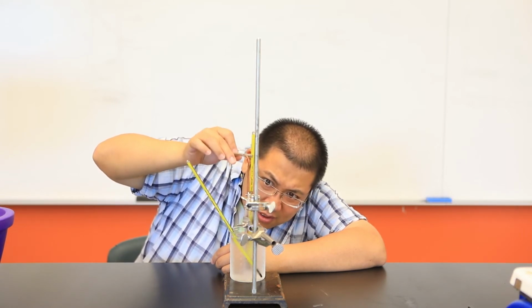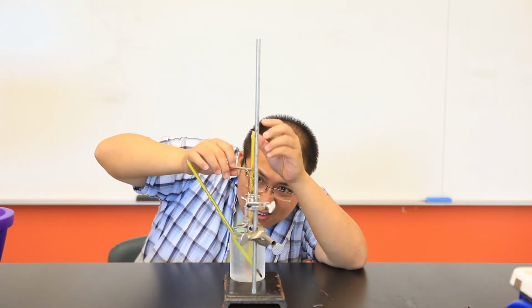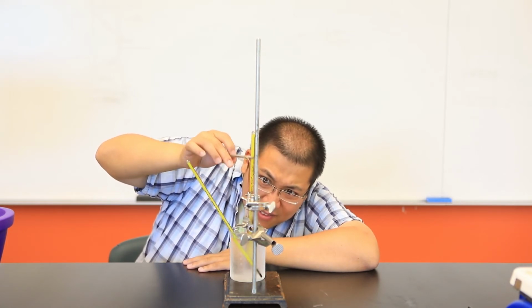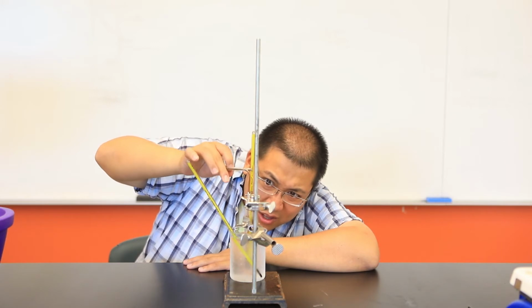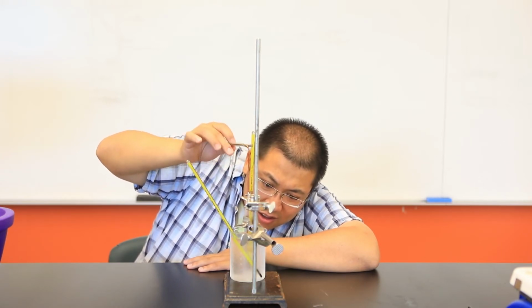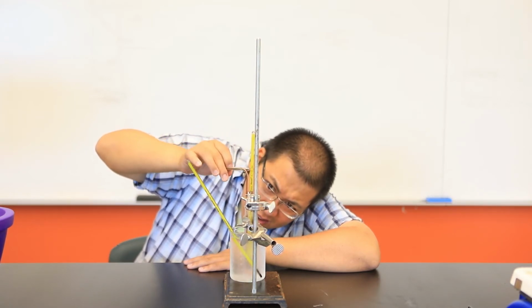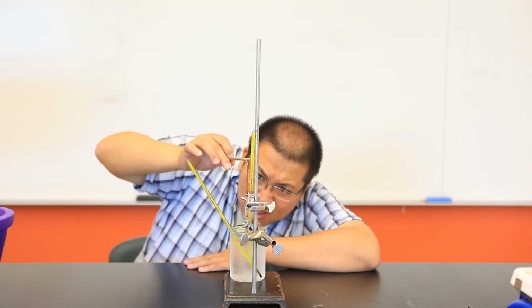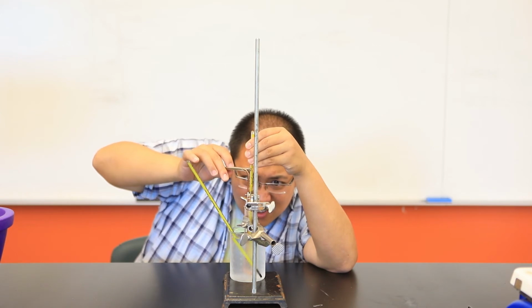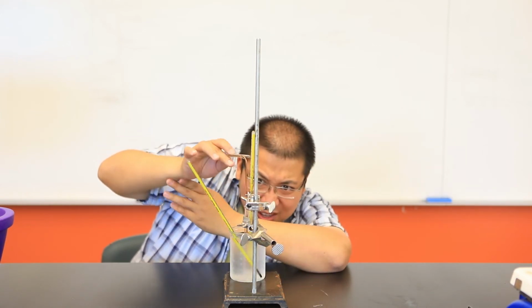Temperature? 14. Temperature? 13.9. Temperature? 13.9. Temperature? 13.8.